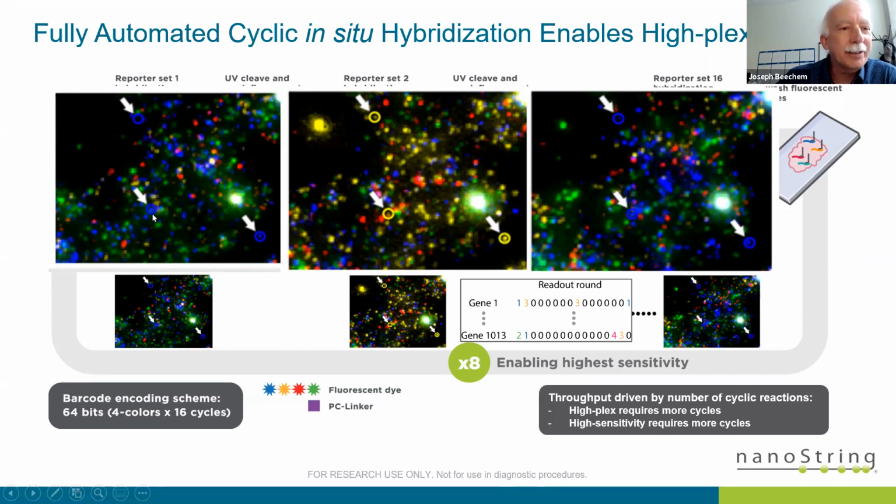Here's the little blue. There's a single RNA molecule there with one of our 20 nanometer sequencing barcodes on it. Here's another one. We cycle out to yellow, and there you can see a yellow one that's positive on this guy. We're cycling later on back to blue. They turn blue again, and you're doing this over your entire tissue section. That's how you encode it.